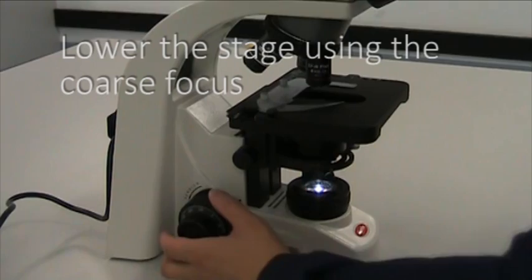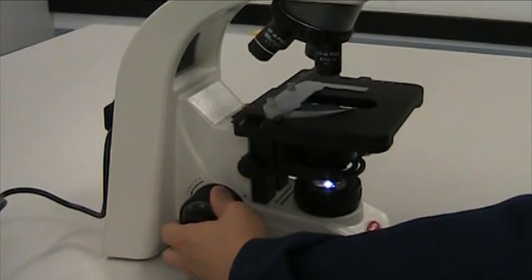By rotating the coarse focus knob, lower the stage to its lowest position. The coarse and fine focus knobs adjust the height of the stage.